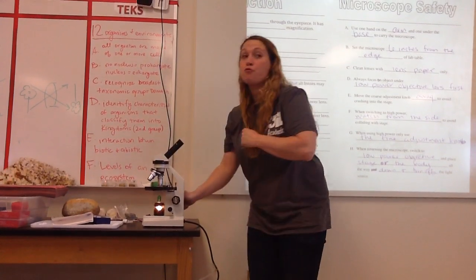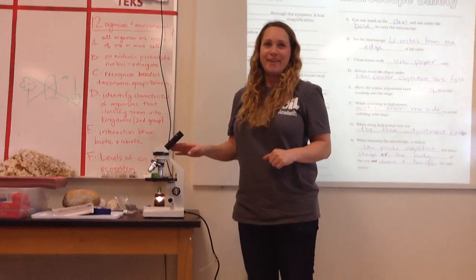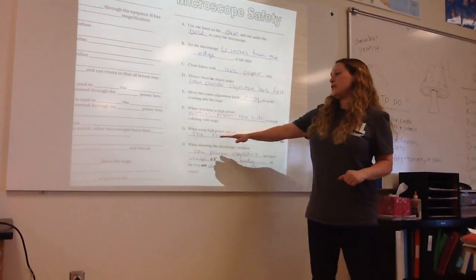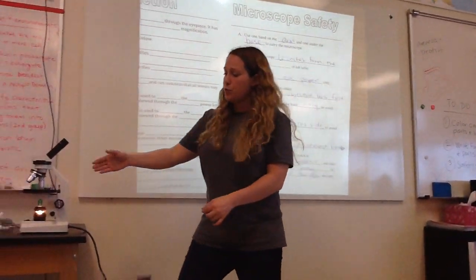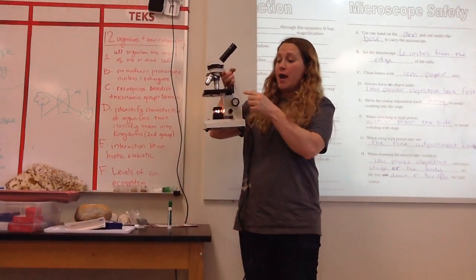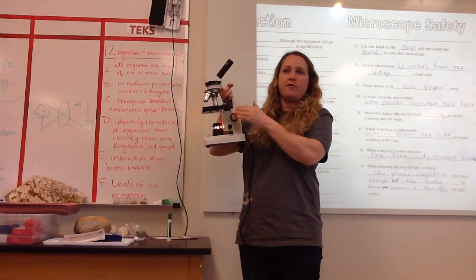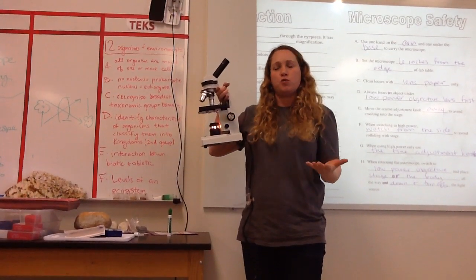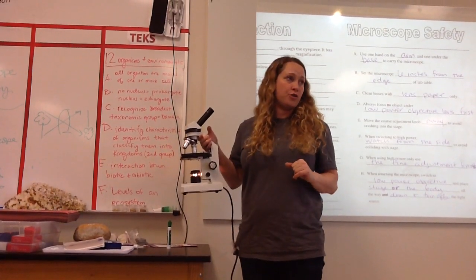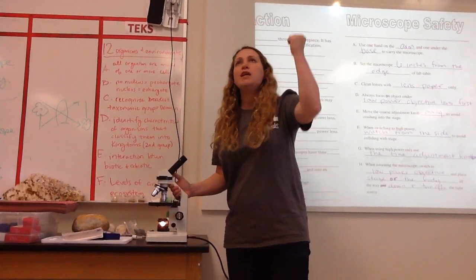Woo! And now I'm really, really close. It's pretty amazing, okay? You excited to look? Mm-hmm. It's gonna be cool. Okay, so when you're using the highest power, they recommend you only use the tiny knob because now you're so close that this knob moves it too much, okay? So you may have to figure out which one works for you when you're in this situation, but always, if you're going to move closer, you take your eye away and make sure it doesn't crash. That is the most important thing. Think you can handle that? Yes. I believe in you.